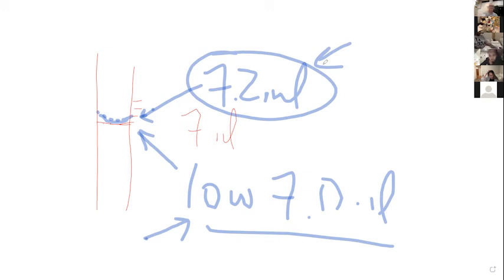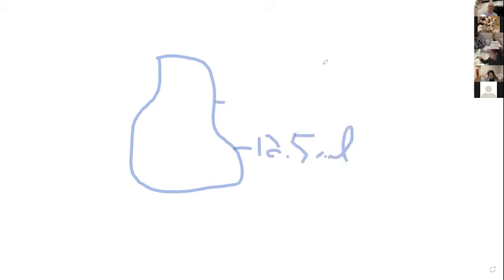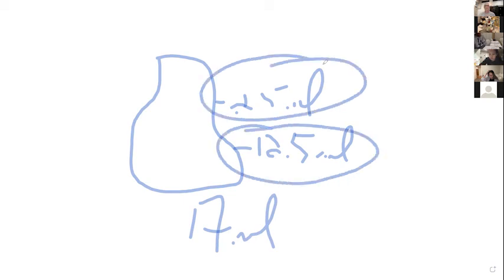For the 50 ml cylinder, each point is 1 mil — the large marks are at 10, 20, etc., with 10 dots in between, so your intervals there would be 1 mil. For the flask, we've only got 12.5 and 25, and you're asked to measure 17 — the lowest it can be is 12.5 and the highest is 25, so those are your high and low intervals. Your precision on that is going to be pretty poor. For the 250 ml beaker, you have the same consistent shape all the way across but no interval marks until 50 mils, and then they're every 10 mils.